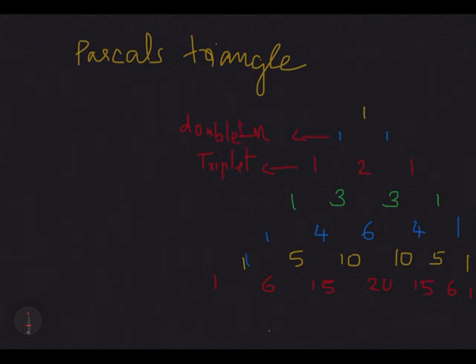If a signal splits into 3, the intensity ratio is 1:2:1. If a signal splits into a quartet, the intensity ratio will be 1:3:3:1. If a signal splits into a pentet, the ratio will be 1:4:6:4:1. Thus a signal can be split into a hextet, heptet, and so on. The signal can be split because of the magnetic interaction of the protons on the adjacent carbon atom.